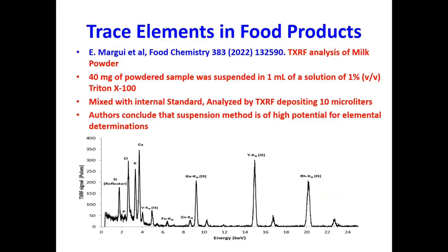What they have done: 40 milligrams of powder sample was suspended in 1 ml of a solution of 1% Triton X-100 mixed with internal standard. And they could analyze using internal standards yttrium and gallium. Here you can see elements like chlorine, potassium, calcium. And here also they have successfully applied this.